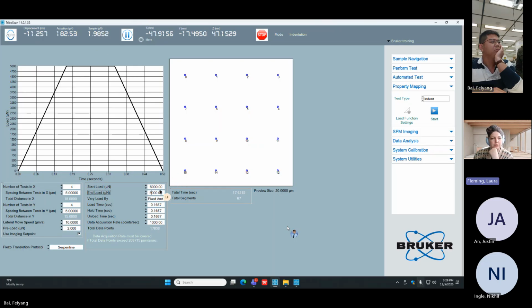And you can see they add up to 0.5 seconds. So this 0.1667 is the smallest number you can have. This is the fastest this indent can go. Okay. You have a 2D transducer, so we might actually need to slow that down more. We'll start with these settings and see if we need to correct them.